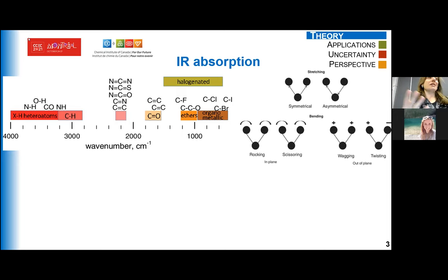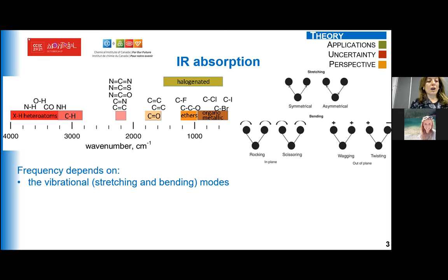The vibration of the molecules depends, of course, on the atomic weight of the atoms and also on the bond angle. That makes each functional group have a frequency that is characteristic of it. So that's the useful information for the characterization of the molecules and of the functional groups.